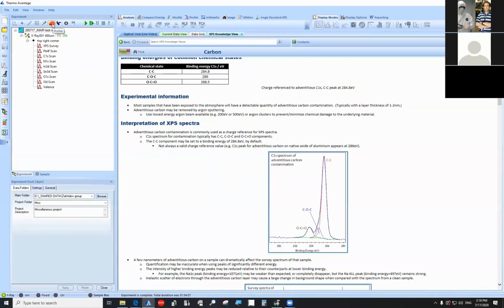When you insert a profile, this little guy right here, that allows you to either just use the ion beam to etch the surface of your specimen to, say, clean off adventitious carbon, just to get it ready for your standard analysis, or you can do a full-on depth profile where you give it a set of conditions for how long do I etch, with what energy and current condition, and how many times do I repeat this individual step, whilst inserting a scan in between every single one of these etch runs.